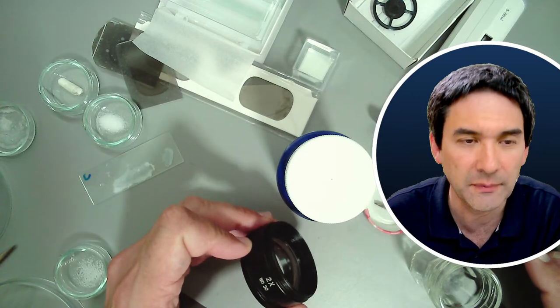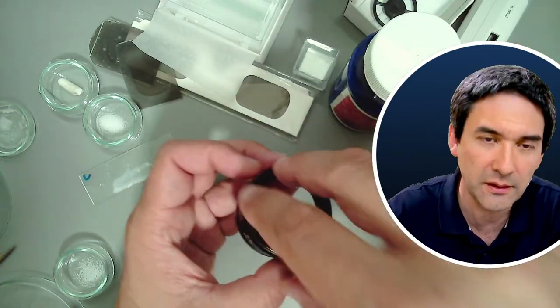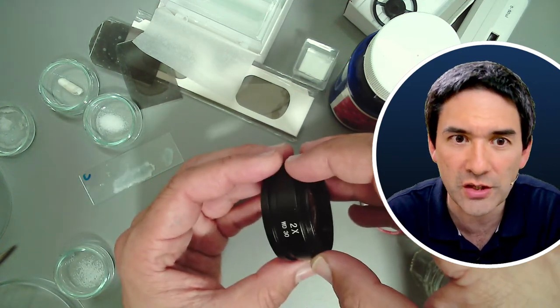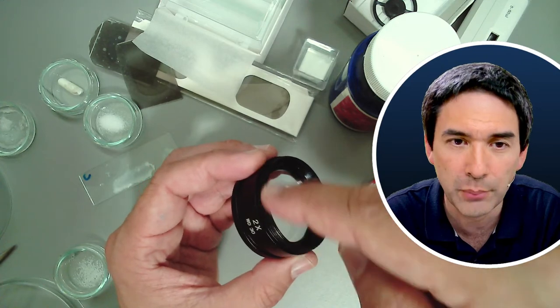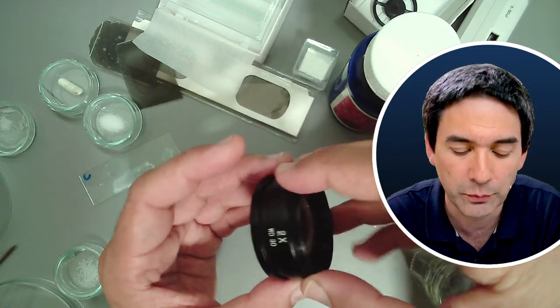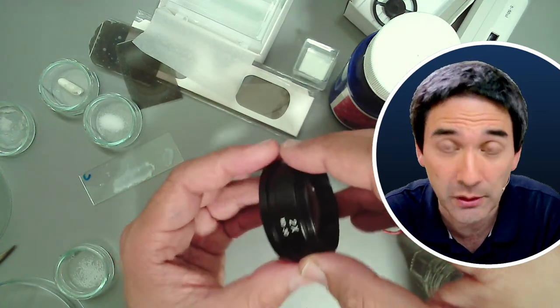I just wanted to go back again to the desk view. I have over here the so-called Barlow lens, and those Barlow lenses can be attached beneath the stereomicroscope. So the suggestion is: is it not possible also to place a polarization filter here between the Barlow and the objective lens? And in principle, this is possible.